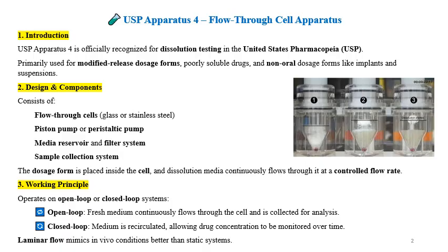As the name indicates, it consists of flow-through cells made of glass or sometimes stainless steel. It has a piston pump or peristaltic pump, a media reservoir, a filter system and a sample collection system.